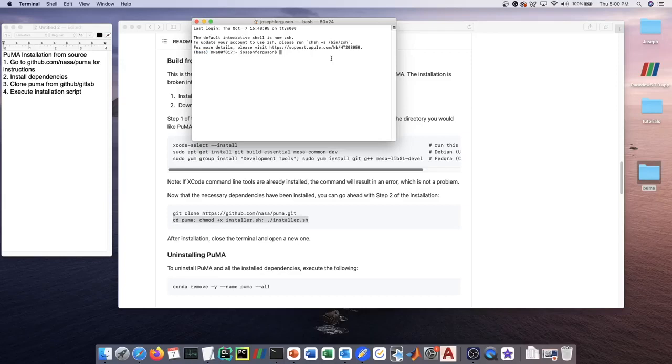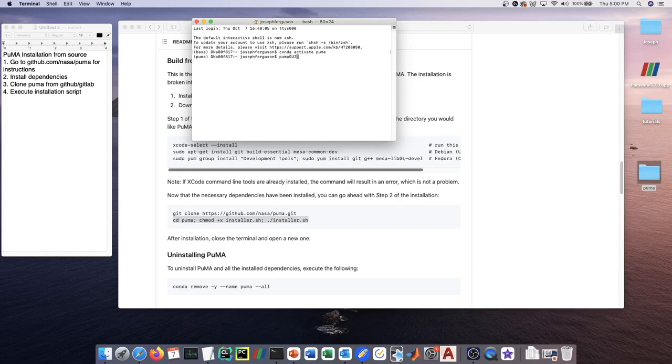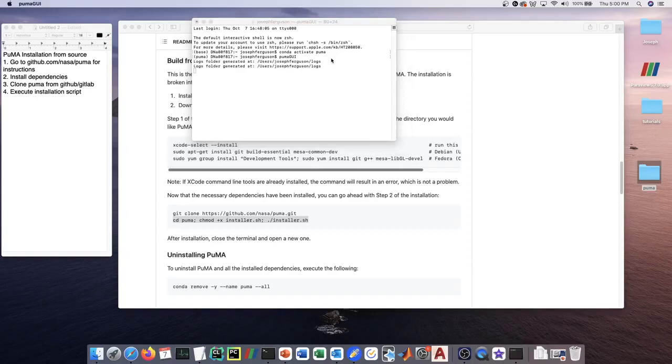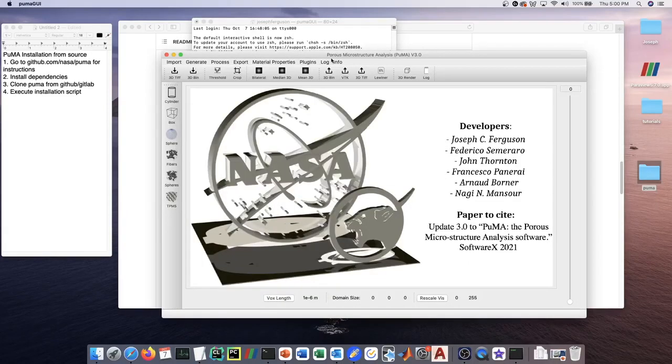Since Puma uses conda to manage the environments, we have an environment for Puma. In order to launch the Puma GUI, for example, you're going to type in conda activate Puma, and then run the command Puma GUI. Then the GUI should appear.